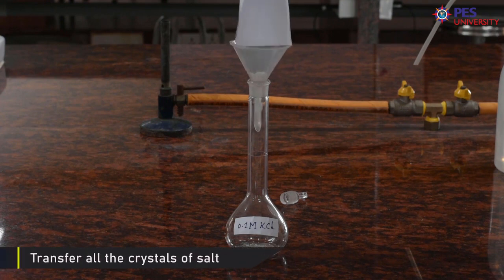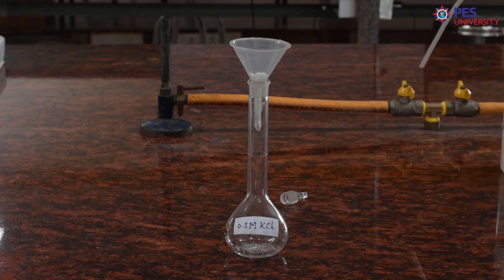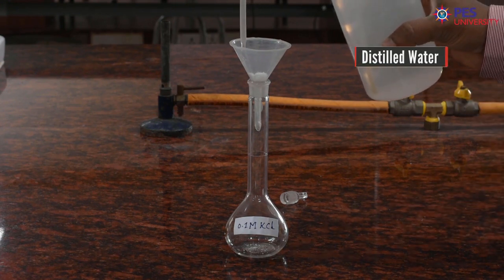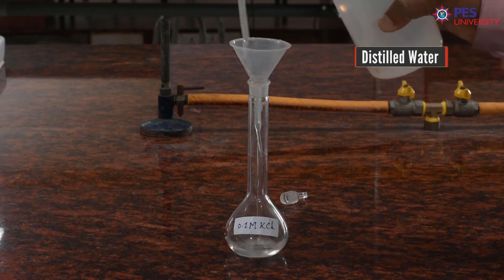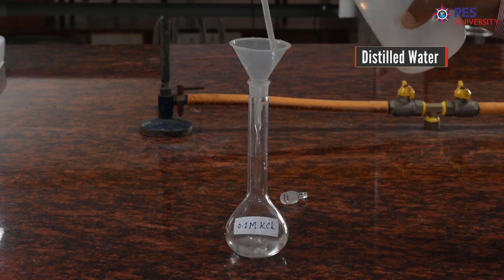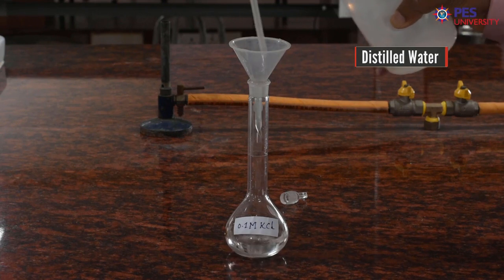Make sure that all the crystals are completely transferred onto the funnel. Then add distilled water like this. Make sure that you are transferring all the crystals into the flask.